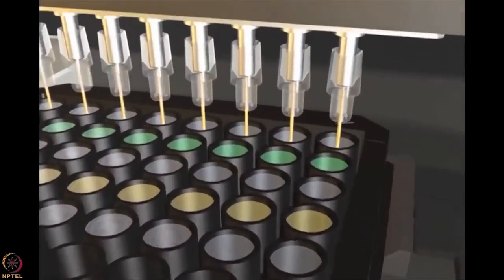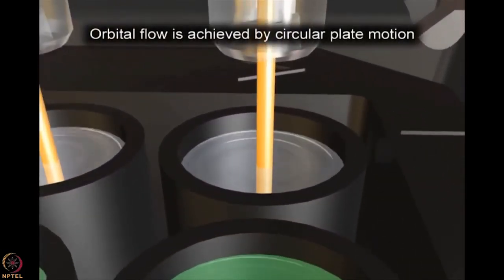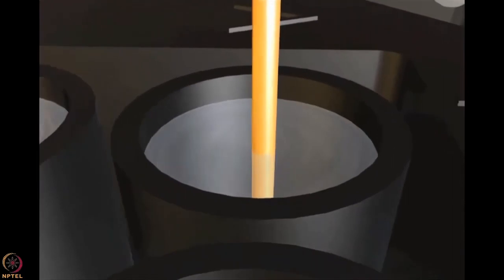Using optical fibers, Octet feeds broad spectrum white light down the sensor and collects the reflections. One reflection comes from an internal optical layer and one from the interface between the streptavidin layer and the surrounding solution. Most of the light scatters in the surrounding matrix.